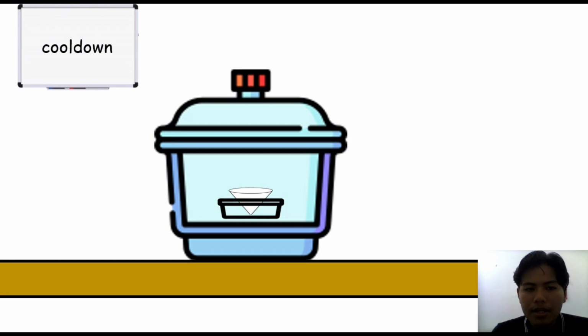This step is very important because after heating, we need the filter paper and the precipitate on it to become normal temperature or room temperature, so that the temperature will not alter the reading of the electronic balance. The reason why we choose to cool it down inside a desiccator is so that the moisture from the air or atmosphere does not get absorbed by the precipitate.